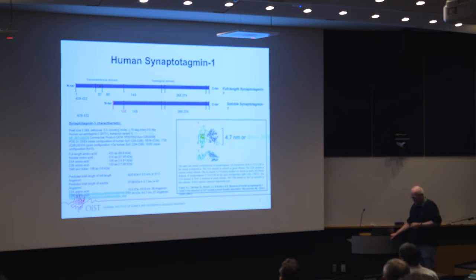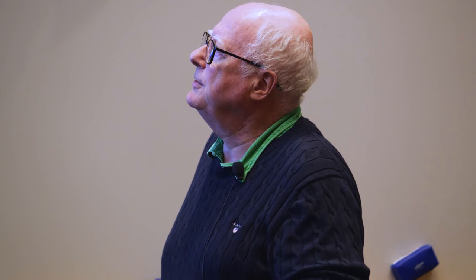So it's a rather small thing, but the major issue with single particle is the alignment of different parts, and when it's small molecules, it's almost impossible to align. Now, we are not dependent on that in tomography because we have our gold markers. So we can actually continue and see all those small things.